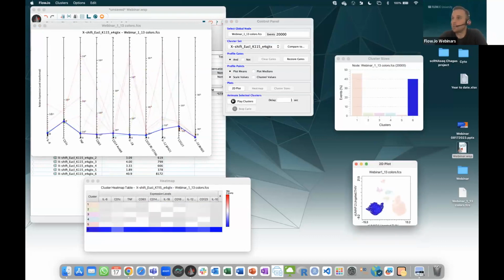If we merge clusters, is there a possibility to save this for the next time Cluster Explorer is open, or is everything lost when closing it? No, Cluster Explorer doesn't save anything. So if you name or merge within Cluster Explorer, it's not going to save.